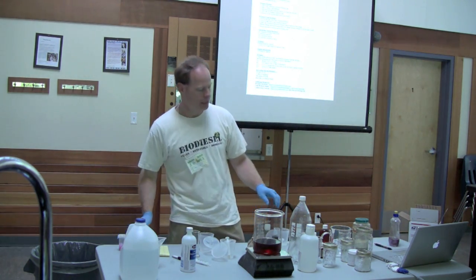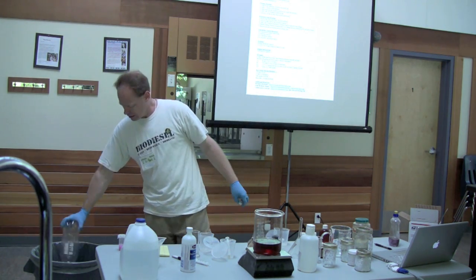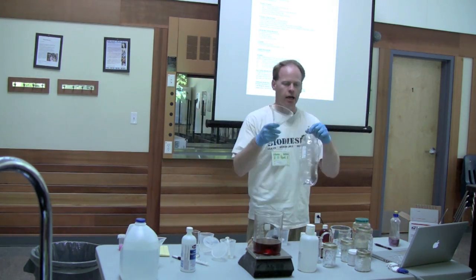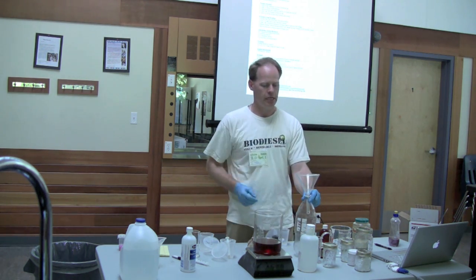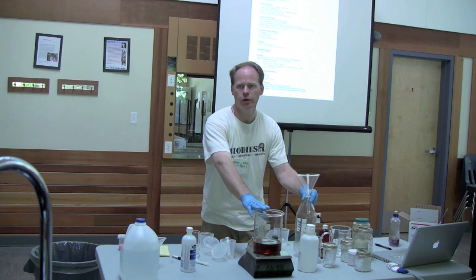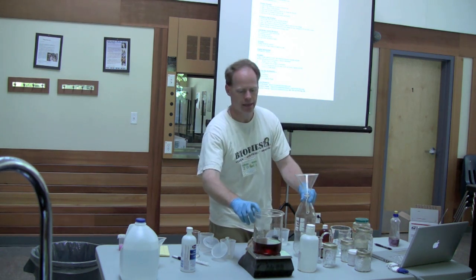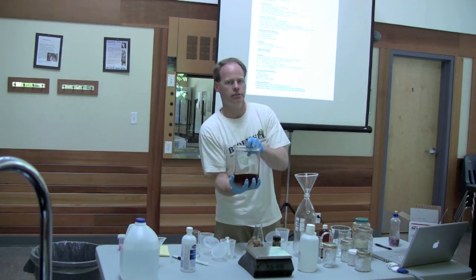Making biodiesel wasn't as complex as that. If you've been online, you've probably heard of the Dr. Pepper method. I hear Dr. Pepper makes the best 2-liter bottles. I don't know what this one was, but this is called a mini batch, and this is probably what a lot of you wanted to come see. We're going to take usually a liter of oil and heat it up to 100 to 120 degrees Fahrenheit. I don't like to go much hotter than that. We heated this up to about 130, and it's still good and warm.